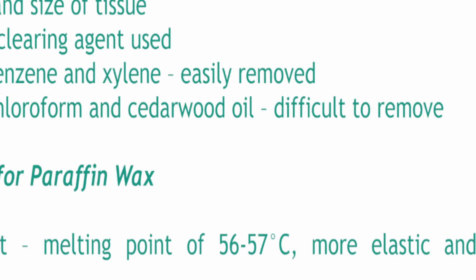Okay. Bioloid is something that we use for eye samples, particularly for histology sections of eyes, and then tissue mats that contain rubber. So the only thing that you need to remember here is the substitute, paraplast and bioloid. I would like you guys to underline paraplast and bioloid when you are studying this, okay?